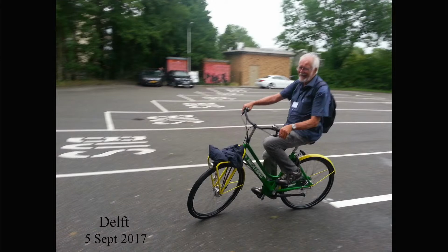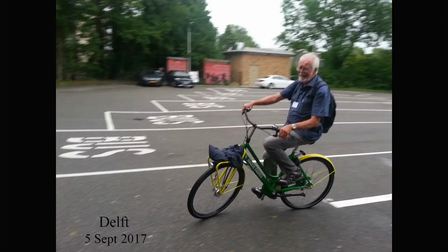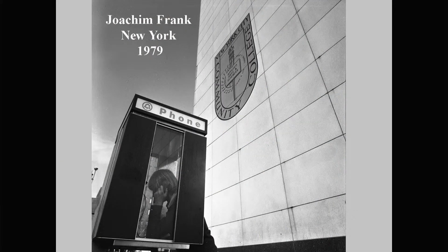And then the other thing is, from these types of images you get all these projection images, and how do you make that into a 3D structure? That was the next issue, and I had an interaction with Joachim Frank about phase contrast transfer functions in partial coherent illumination. I'd written a paper about it and sent it to him, and he said, "Yeah, you don't understand this," and that's when I understood that he didn't understand the theory behind these things.